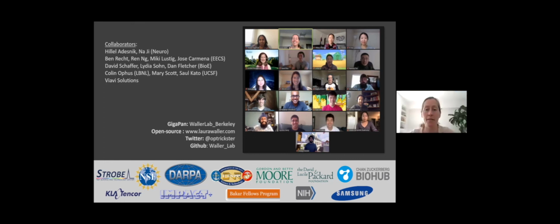I think that what I've seen is its primary benefit is making things faster. Putting all of the effort and time into the training means that you can have this neural network that can solve the result faster, which we haven't cared about too much because this is all researchy stuff. But in the real world, people want to see the result of their image right away so they can decide what experiment to do next. So getting them that result faster, I think, is what it's been most useful for. It's also good at removing weird model mismatch artifacts, but it comes at a big cost of having to build these training data sets. So it really depends on your application.